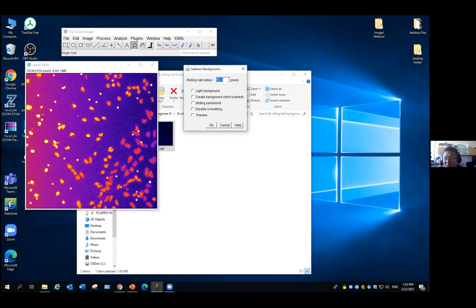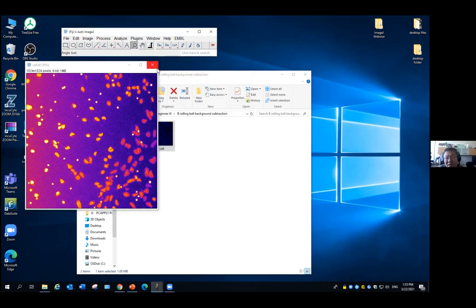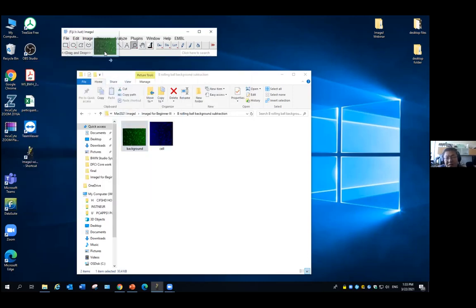Okay? But again, as I mentioned, this is not actually a very good way to do it. In this case, you have to go back. The best way to do it is to go back to your microscope, fix this problem, then you don't have this. Yeah. So let's say if we go to the other one, the background image.